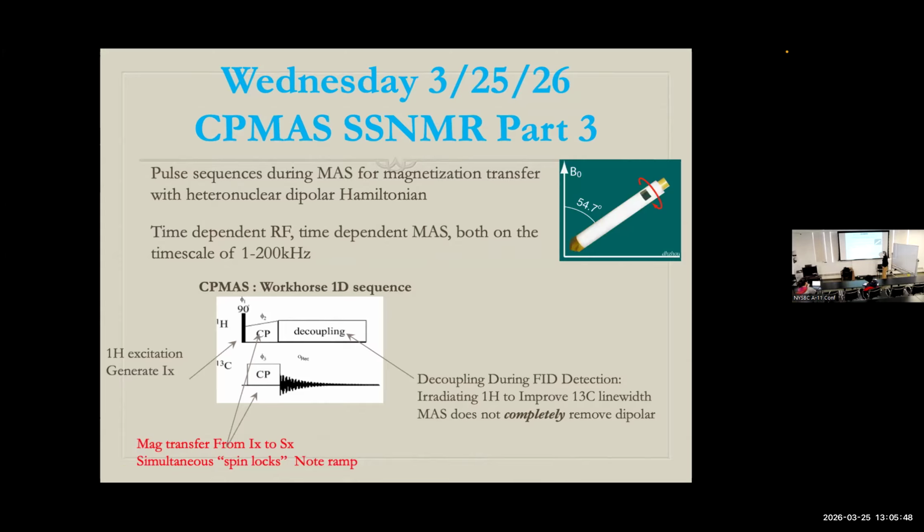So that's sort of the cartoon of the larger context, but as is typical for pulse sequence analysis, we're just going to zero in on this when we do our Hamiltonian analysis, because that's the new piece we're learning about today. Maybe we'll come back and talk about some other things, but I assume you understand the 90-degree pulse. So what we're talking about is just this element.